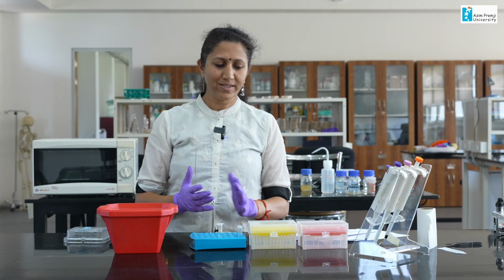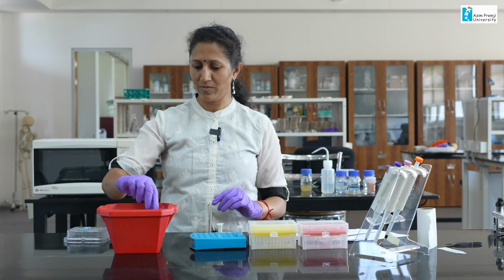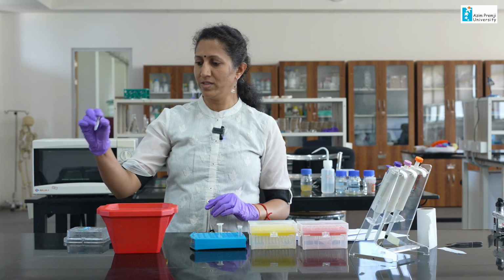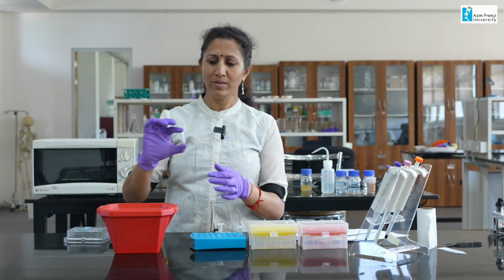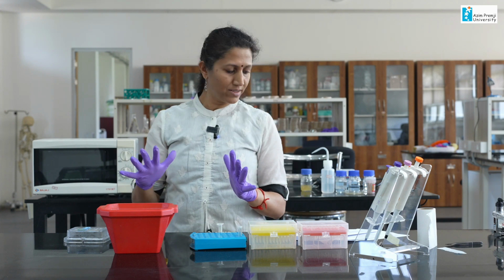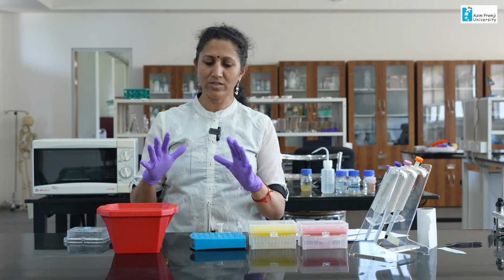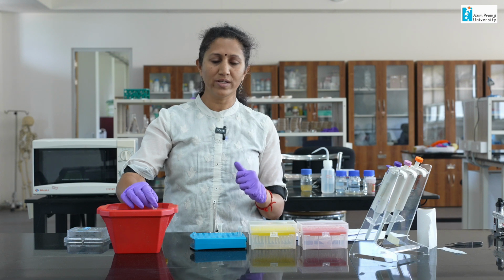What exactly happens in PCR is you have genomic DNA, the whole mixture that we have. Once I took it out from the water bath, I kept the DNA sample in ice. Throughout your PCR process, whatever reagents you are going to use, you have to keep them in ice. So, I have stored my DNA sample in ice. This is genomic DNA now. Genomic DNA is the total DNA that is extracted from the cell. Now, in the PCR, what I am going to do is, you have a whole lot of DNA, a big stretch of genomic DNA.